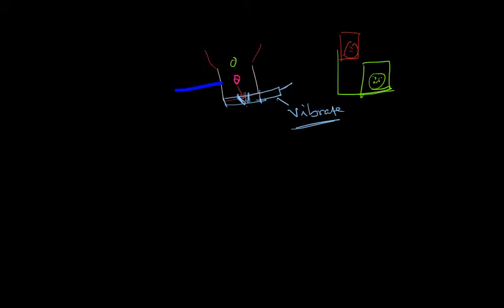It makes a stream, and the stream would break into droplets at some point of time. The stream wouldn't be continuous always, depending on the velocity of the stream. However, this breaking is uncontrolled. If we are not using any energy, then this breaking of the stream is uncontrolled and we won't achieve the desired break point. I'll talk about why you would need a desired break point.